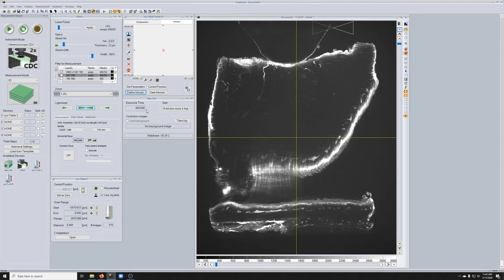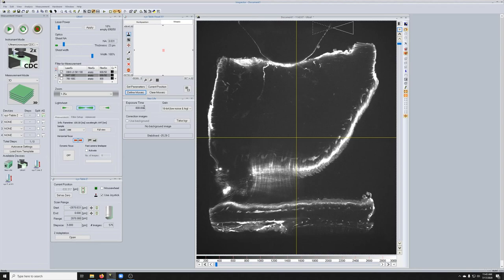The way we do it is we counterbalance exposure time with laser power. The quality is going to be roughly dependent on the total amount of light that the sample receives. Whether it receives it because you expose for a long time or the laser is on for a long time, both will give you roughly the same quality, but one will do so with a much higher risk for bleaching, whereas the other will cost you a lot of time.